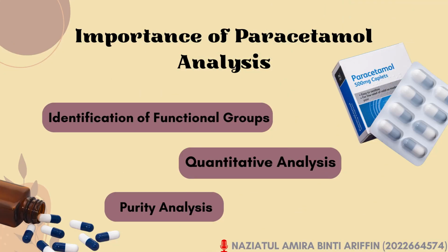So, what are the importance of paracetamol analysis? Firstly, FTIR analysis is helpful in identification of functional groups. FTIR spectroscopy can identify the functional groups that are present in a molecule or compound by detecting characteristic absorption bands. Secondly, quantitative analysis. Even though FTIR is primarily qualitative, it can be used for quantitative analysis by measuring the intensity of specific absorption bands, which correlates with the concentration of the compound.